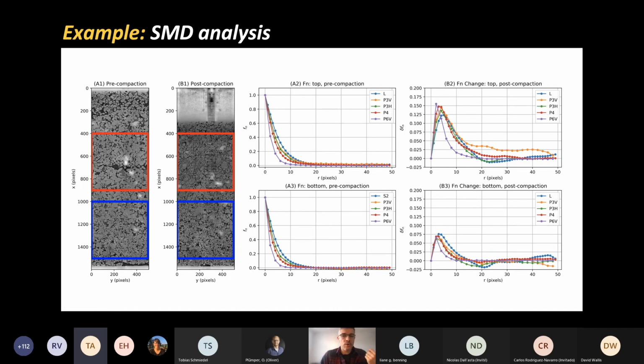If you remember, before I told you that the porosity had increased in the bottom. But actually, what the curve says is, true, porosity has increased, but the average size of a pore has actually decreased. How is that possible? Well, the curves show us that there's a negative bump here at 20 pixels distance. And this means that these curves are telling us that porosity increased by the pores actually being crushed, but the grains rearranging so smaller pores at a distance were formed. So the overall porosity has increased, but the structure of the microstructure has been abstracted and captured by these curves.